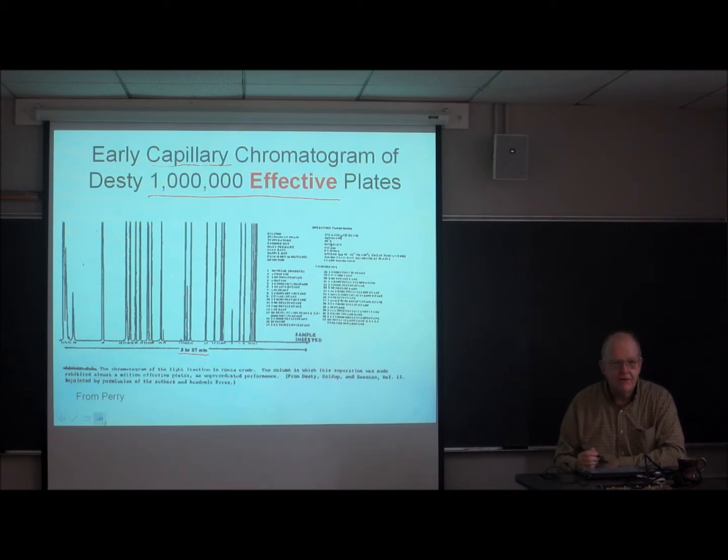GC, by the way, is still, in terms of dollars of instrumentation, about equal to liquid chromatography. And forget about the detector, just the instrumentation and the columns. And it's considered a mature discipline, a mature subject matter. Most instrument companies that make them consider it a cash cow, because there's not a whole lot of new stuff going on in the GC world. So they're not putting a lot into research on it.